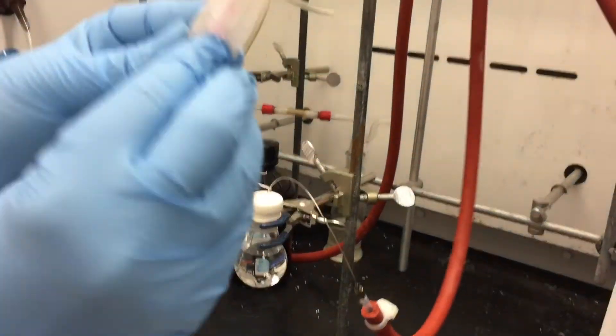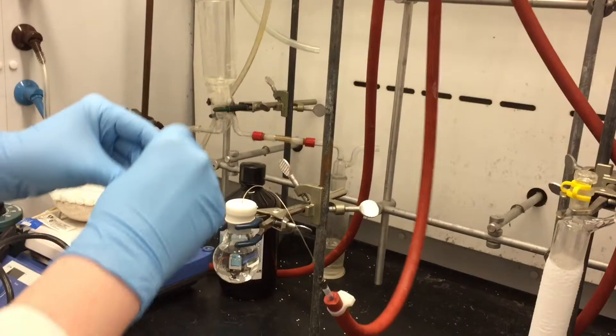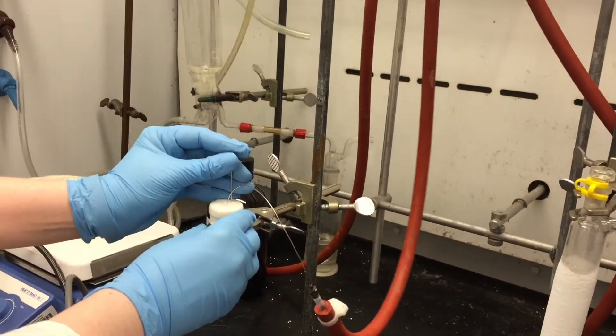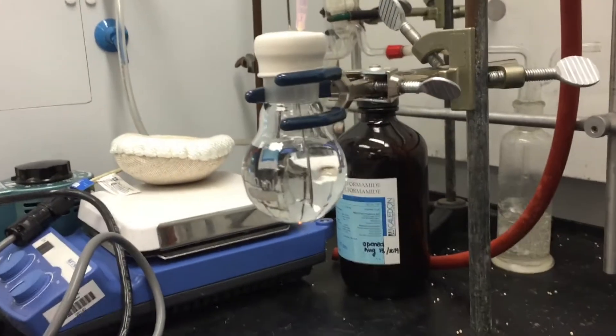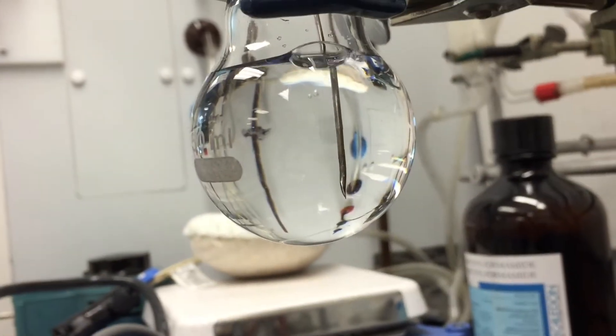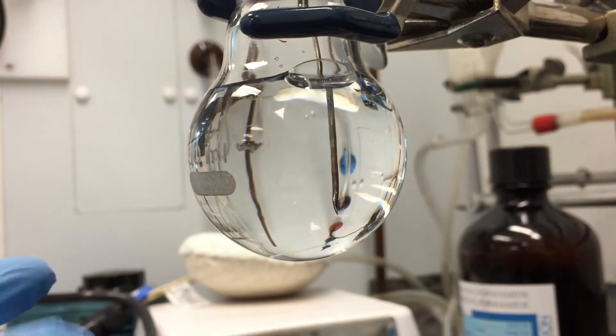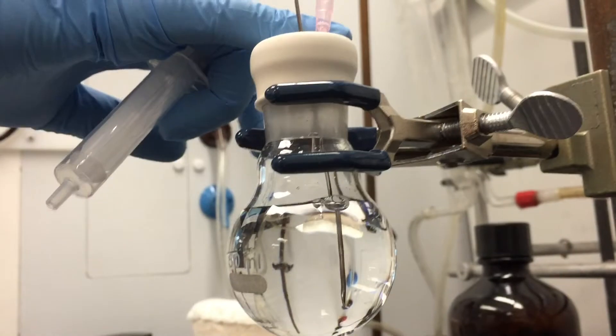The next thing you're going to do is get something like a disposable needle, and you're just going to puncture another hole in and leave that needle in there. As you can see, once the needle is inserted, there are bubbles in my solution. That means that the nitrogen is coming in and will be replacing the oxygen, which will be leaving by this opening at the top we've generated with the needle.